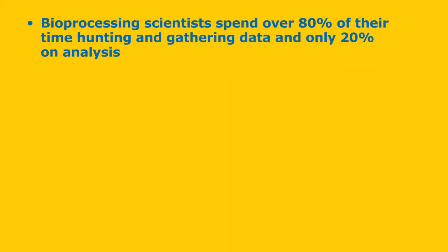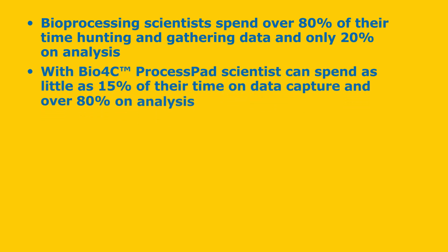Without a structured process data management tool, bioprocessing scientists spend over 80% of their time hunting and gathering data, and only 20% on analysis. With Bio4C ProcessPad, scientists can spend as little as 15% of their time on data capture, and over 80% on analysis, enabling timely CAPAs, quicker release of quarantine lots under investigation, improved productivity, and process monitoring.